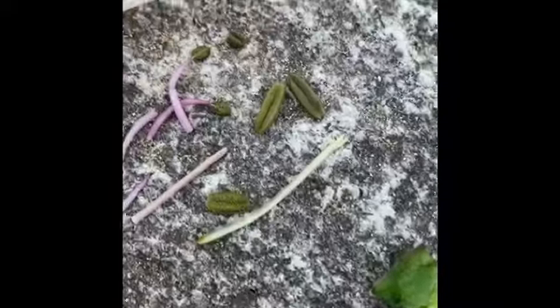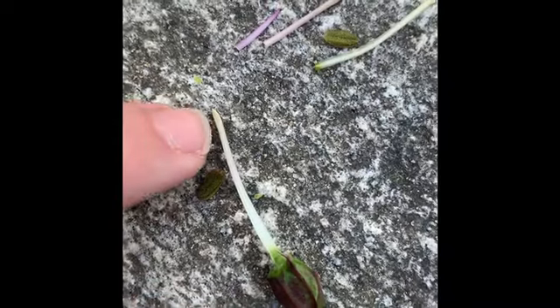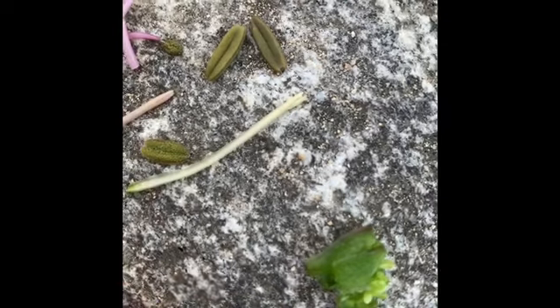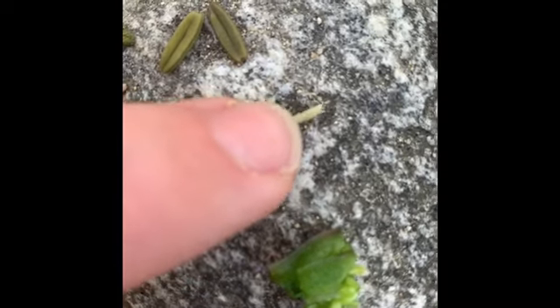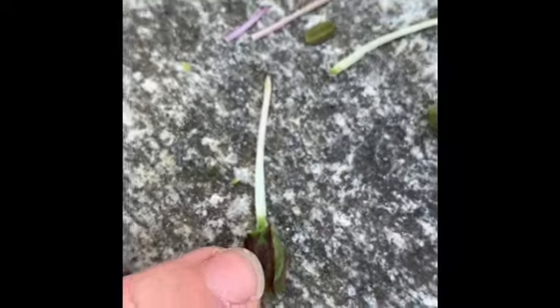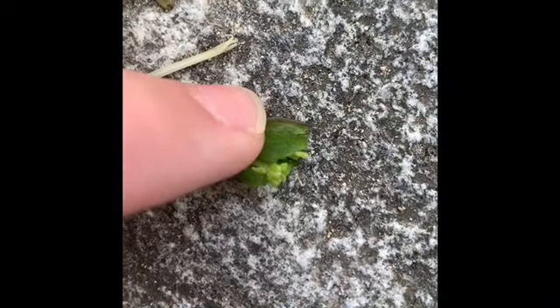And then right here is the female part. Well, this is the whole female part. The stigma connected to the style, and then the ovary. Let me get that anther out of there. All right, so if I zoom in really close right here, you can see how the tip of this is open. That is the stigma. And then the style, again, it's connected to the ovary, which is right here. And inside of the ovary are the little seeds known as the ovules.